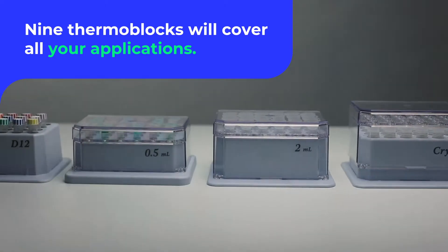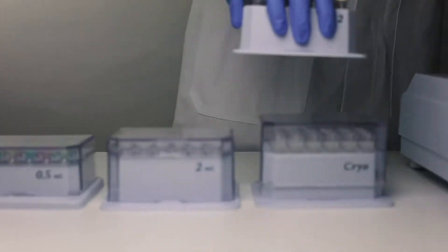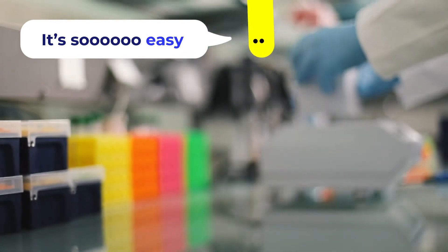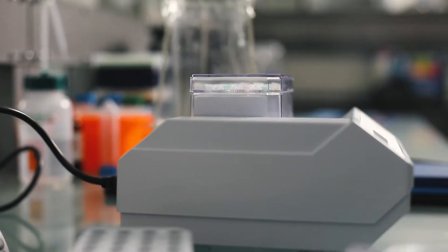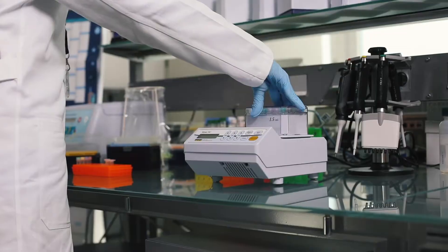Thermoblocks take tubes from 0.2 to 50 milliliters, as well as plates, providing versatility for a variety of sample sizes. Our Mixer HC also features an ISO rack for easy loading of multiple samples in time-critical experiments.